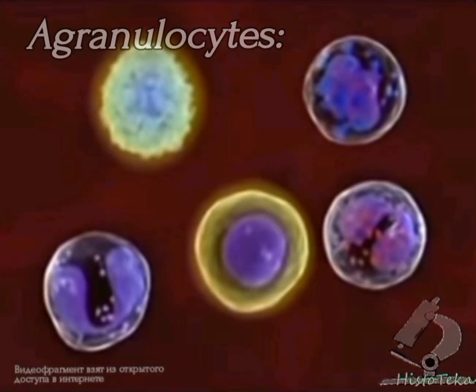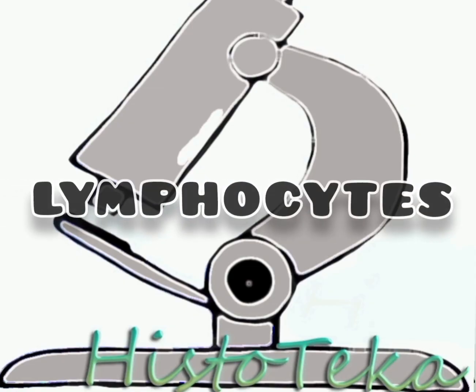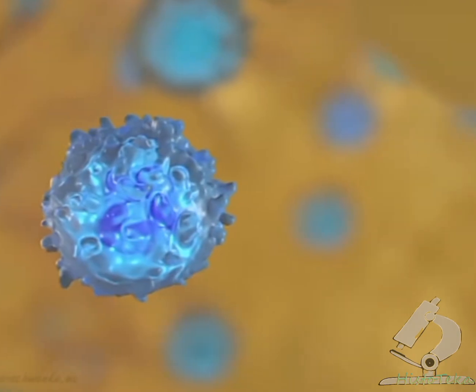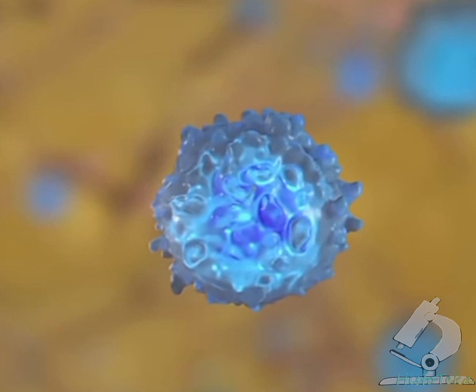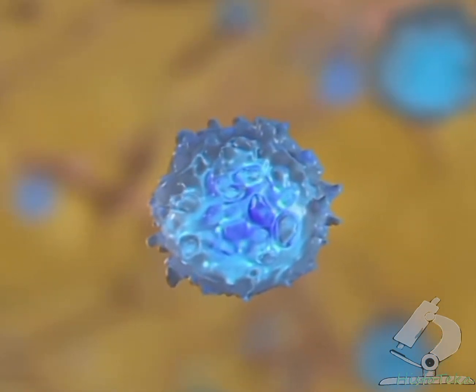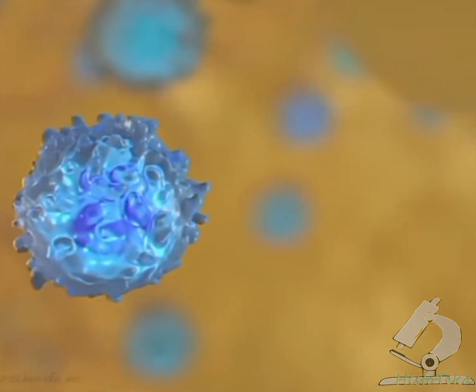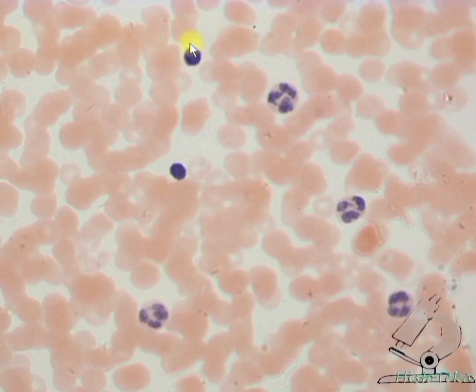Now let's move on to agranulocytes. This group includes monocytes and lymphocytes. Lymphocytes are divided into 2 groups by origin and functions, T and B. And according to their size, they can be small, 6 to 7 micrometers in size, medium, 8 to 9 micrometers, and large, 12 to 15 micrometers. The largest number of blood lymphocytes are small and medium-sized, which means that they are of the same diameter or slightly larger in relation to erythrocytes, and there are no differences between T and B lymphocytes during light microscopy.